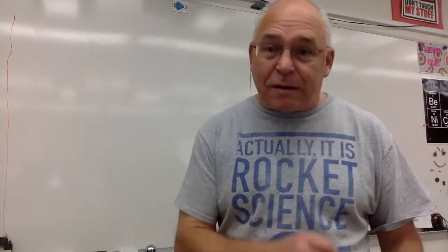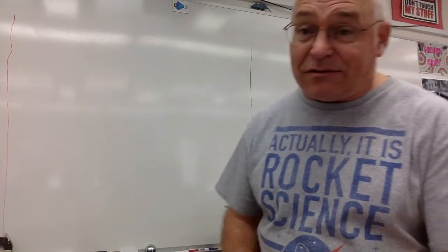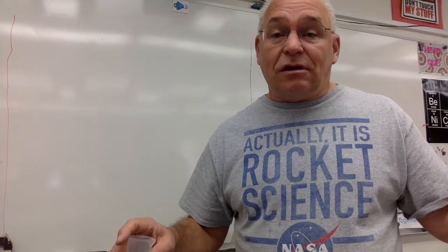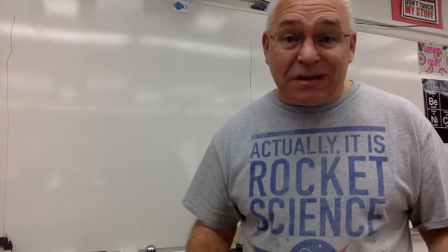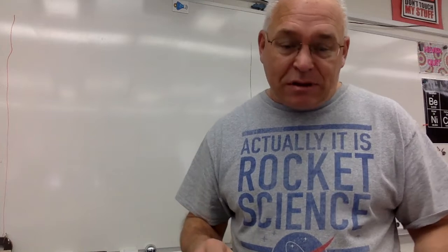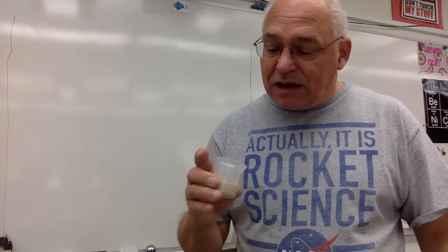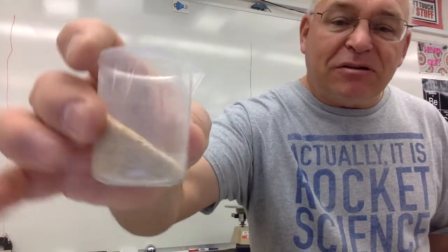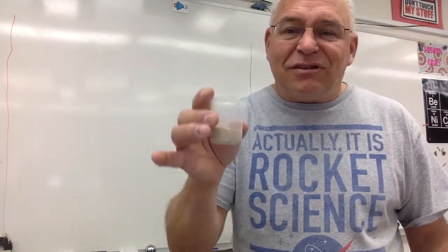Hi there, welcome to another episode of Find That Density. Today we are going to find the density of an irregular object. Something that you cannot use length times width times height or some other formula for because it's a strange shape. But we can use the water displacement method. And actually we're going to find the volume of about a million irregular objects, namely a bunch of pieces of sand here. We're going to find the density of this sand.